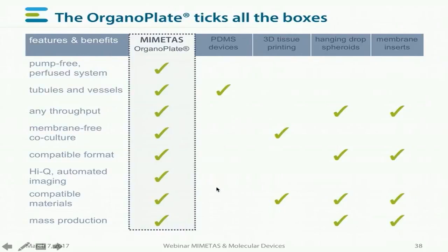Imaging is often difficult, and, which is very important for pharmaceutical applications, PDMS is very well known for absorbing hydrophobic compounds, so it's generally incompatible with pharmaceutical compounds. And finally, it's very difficult, if not impossible, to produce these PDMS devices in large quantities.